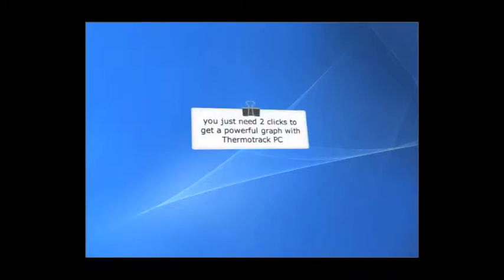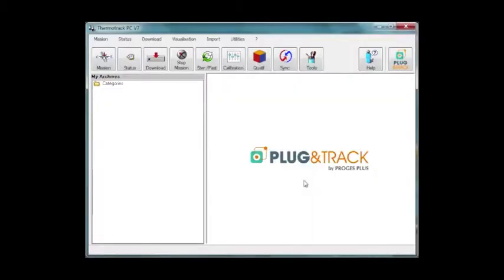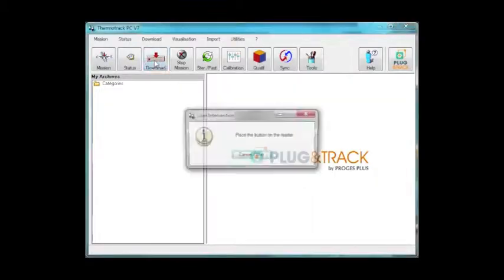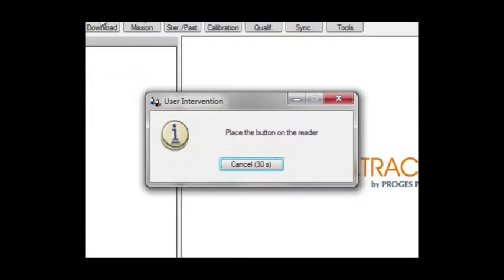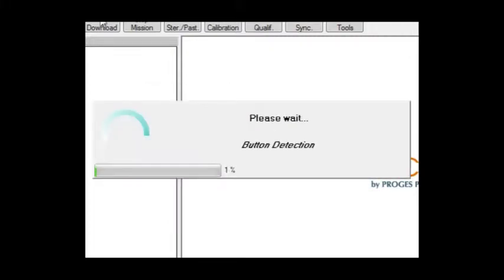You just need two clicks to get a powerful graph with ThermoTrak PC. Use the download icon on the main page. Place the button on the USB reader. The button is read in 5 seconds.